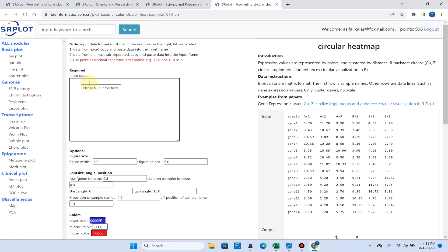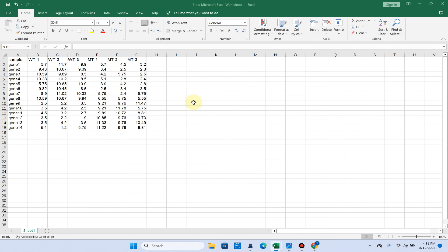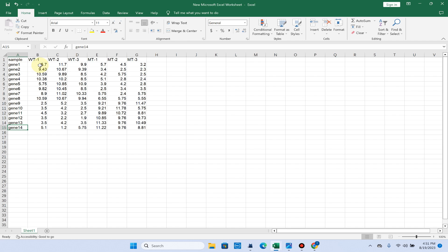Let me show you how you can prepare your input data to draw these circular heat maps. Here you can see we have samples and in this example, I have put 14 gene expression data. You can also put fold changes data if you have.